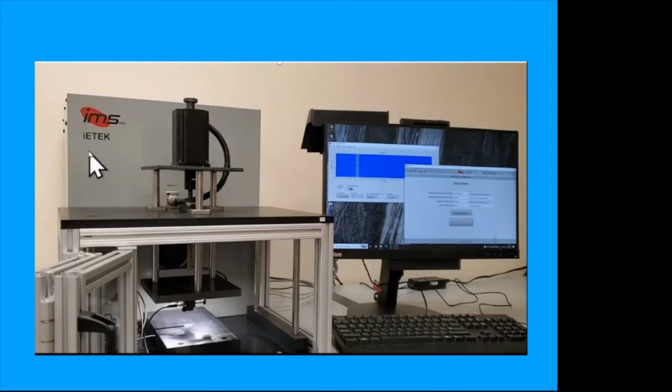The external components are indicated by the arrow. You have the stepper motor, which is on top, and then with a long lead screw controls a platform that has the transmitting and receiving transducers located here, and the housing that locates the lower transducer has a load cell which measures the preload. And then we have the user interface and the raw data display shown in the arrow.